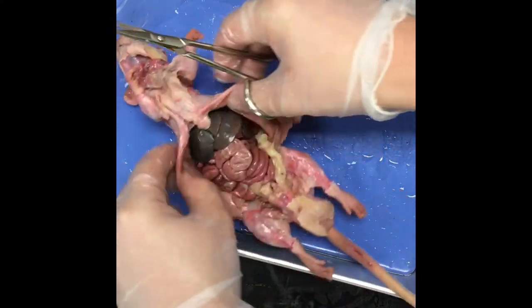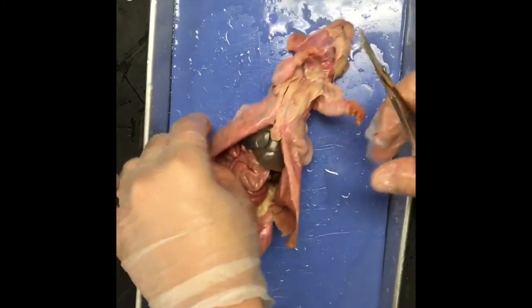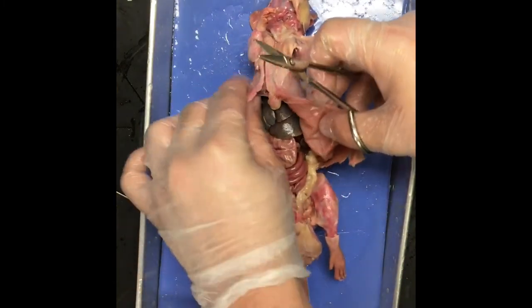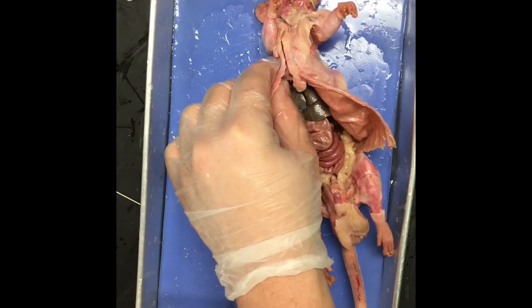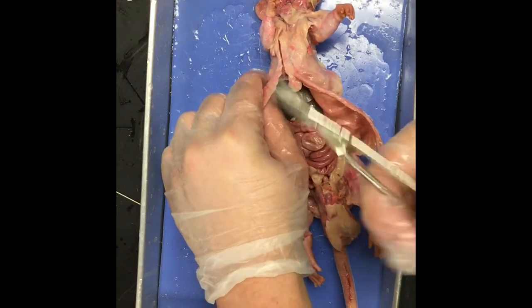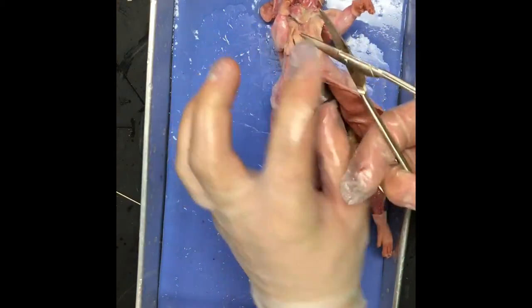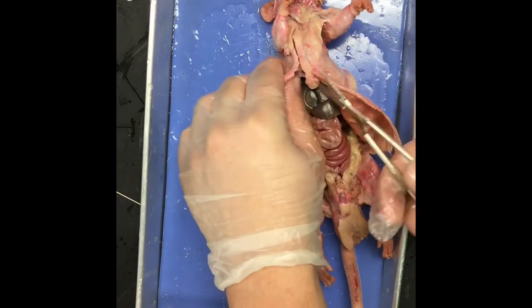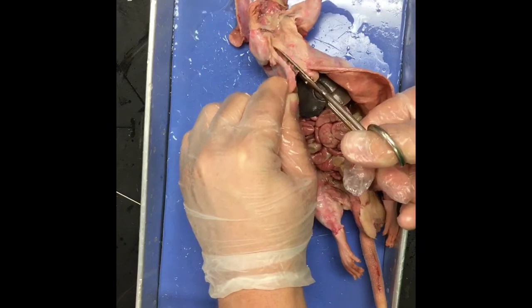Oh, I can see the intestines. All right, so that part's easy to flay apart. This is the rib cage starting here. Because your rib cage is largely cartilage, which you can see by this part in the scalpel, you have to use these. You can't just use the scalpel and come through there. So you want to use the lower part of the scissors where it has a little more force.